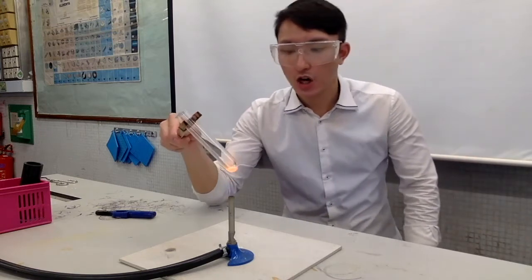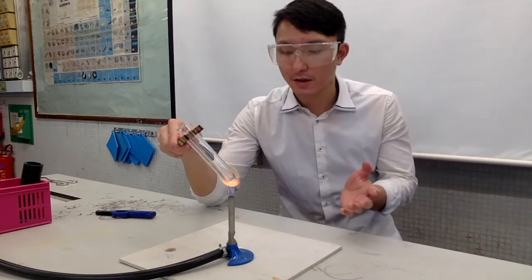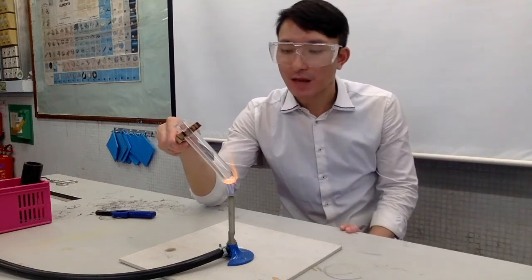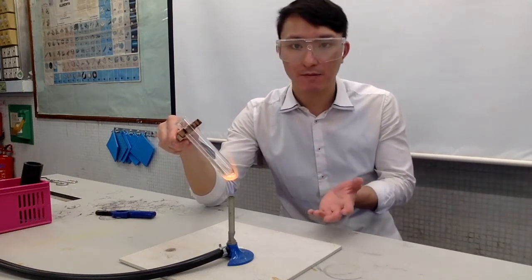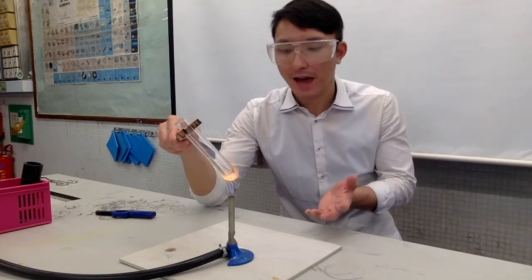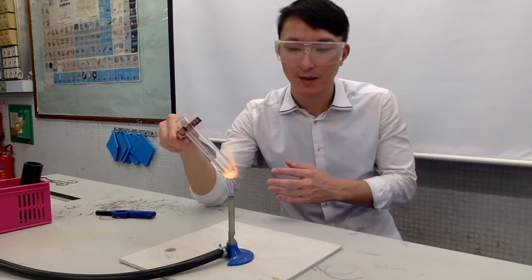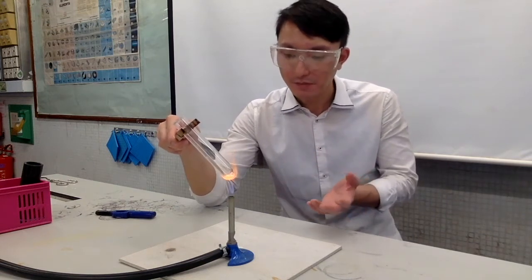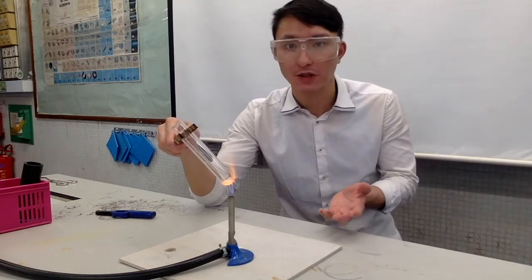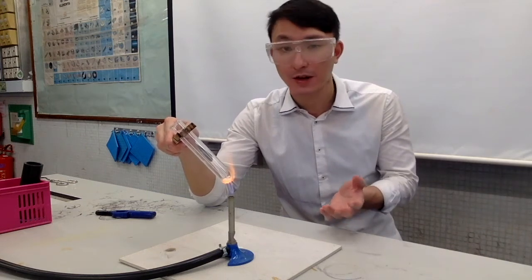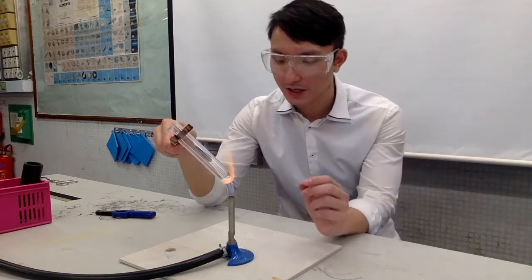Ten minutes have passed with five more to go, but I think that should be more or less sufficient. We are not going to convert all the calcium carbonate into calcium oxide, so ten minutes should be fine — we don't have to heat it for the full 15 minutes. Now I should stop the heating.